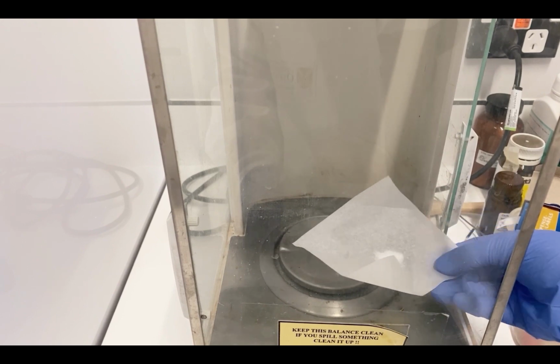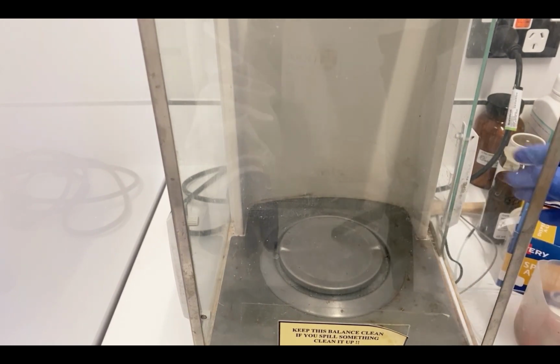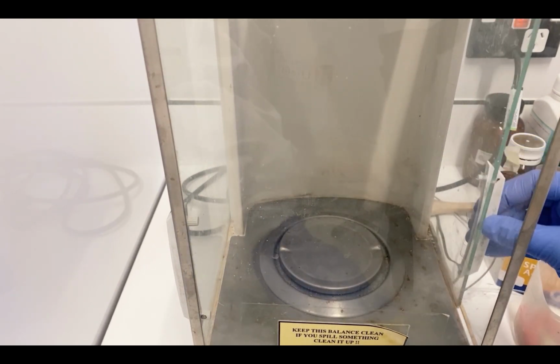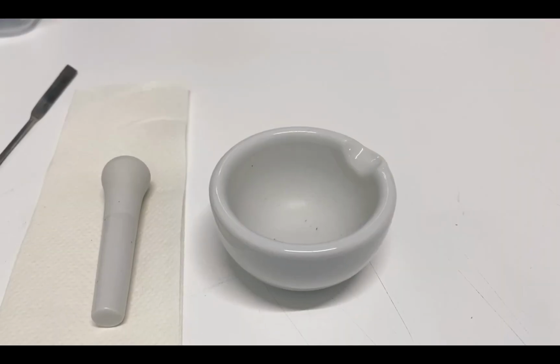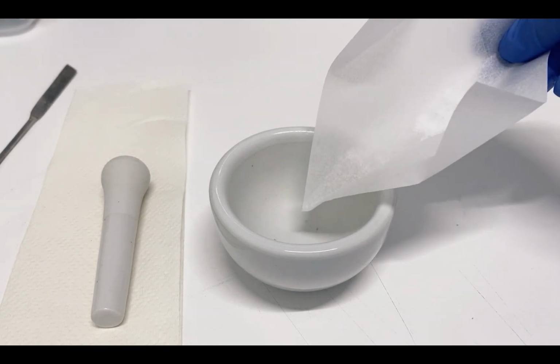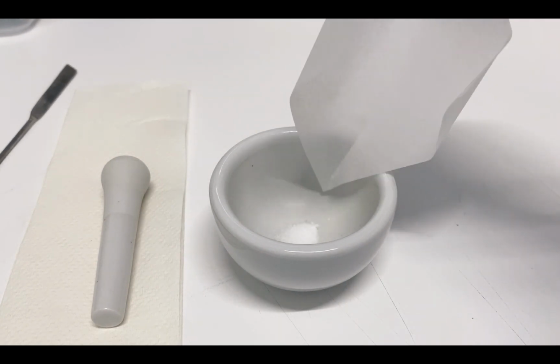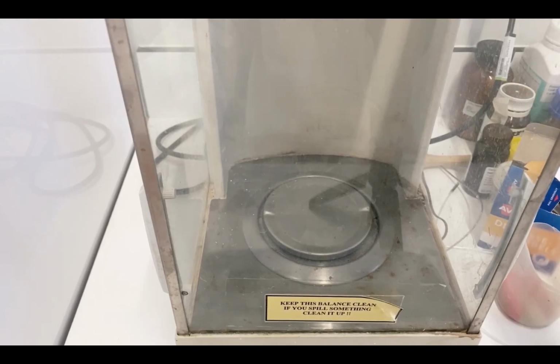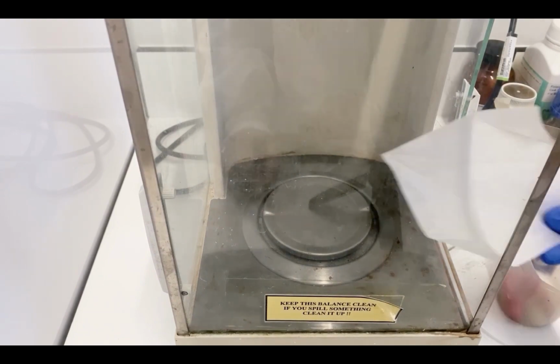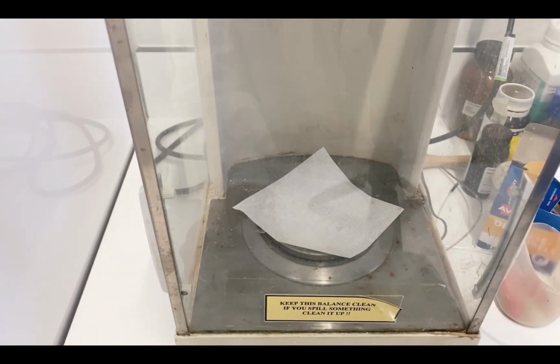Carefully remove the weighing paper with the solid sample, ensuring not to disturb the balance or spill any material. Transfer the weighed glucose into the mortar before weighing the next solid, which is, in this case, magnesium sulfate. Perform the same steps for weighing 0.25 grams of magnesium sulfate.